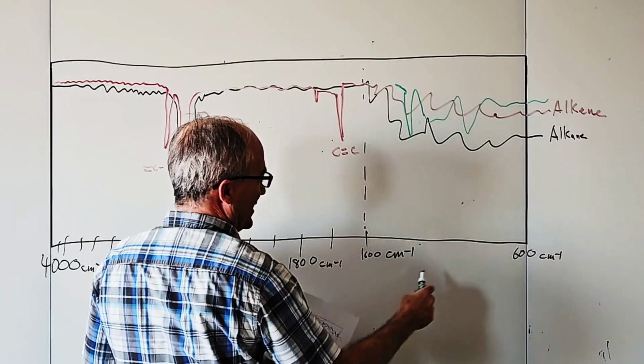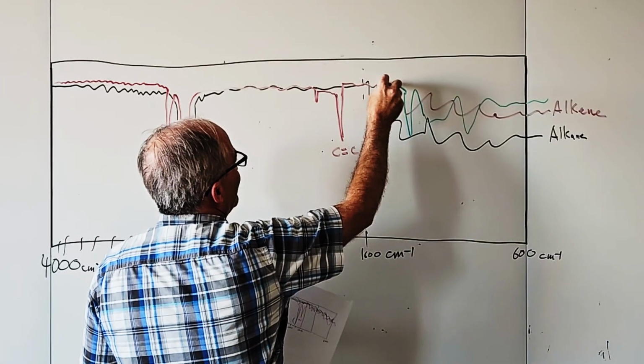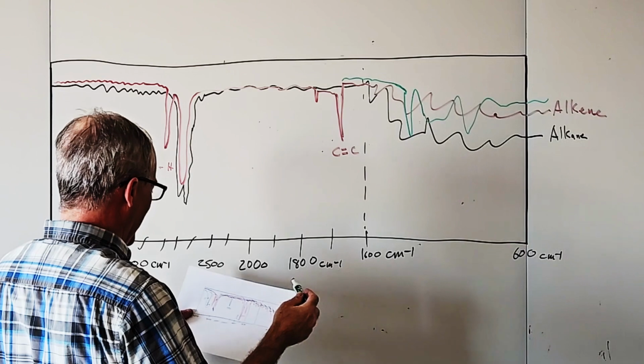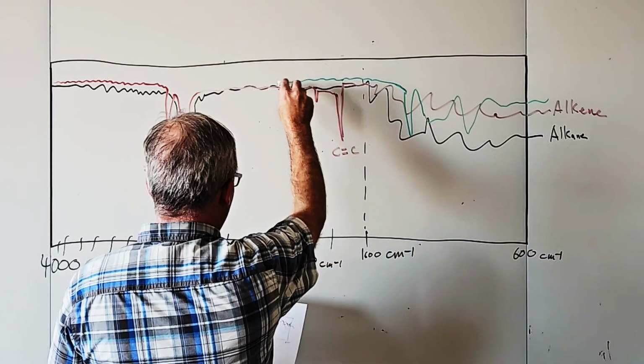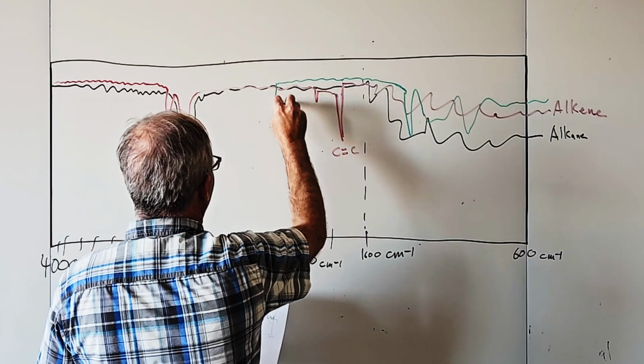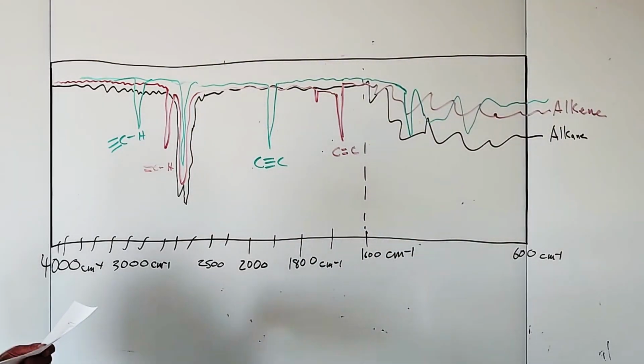And that one PowerPoint slide said some stretching was at 1200. I don't even remember what it was. All I could think about is students objecting. And I want this in the middle-ish. Oh, everything has this. So this isn't necessarily drawn to scale.